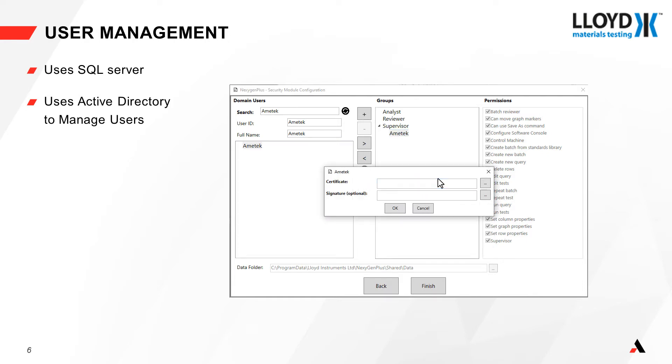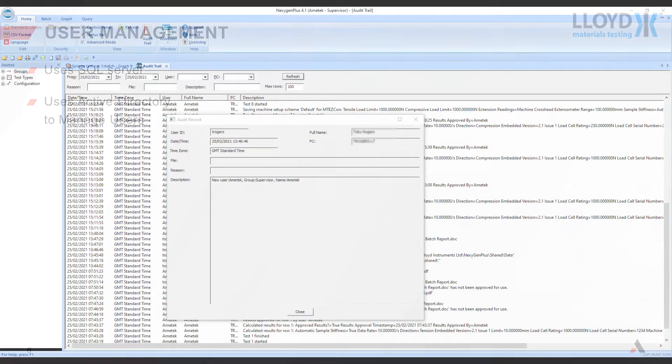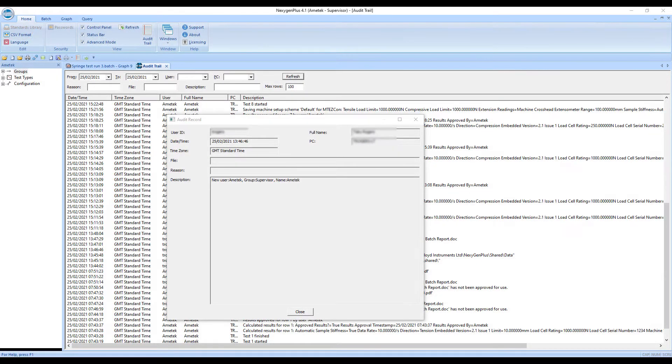Each user can also be assigned a Digital Signing Certificate in PFX format. The audit trail logs the addition of a new user.